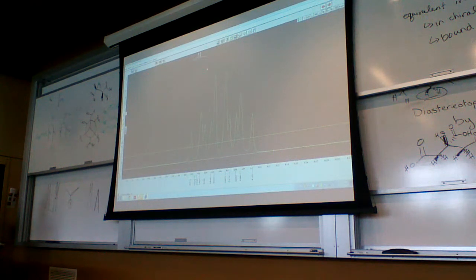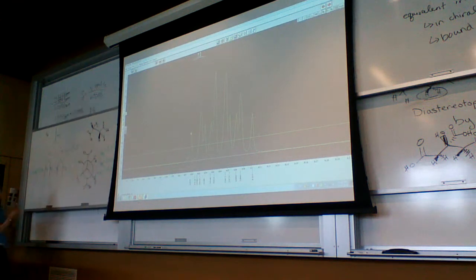7.06 between the first two peaks here, and .02 for the next two peaks. I'm always starting with the one on the outside and going in to determine my coupling. So you're going to have a smaller coupling and then a slightly larger coupling. You can kind of see that.